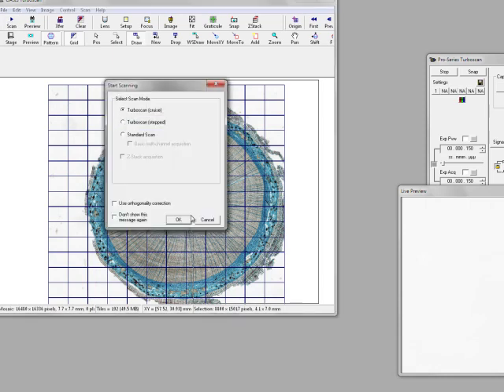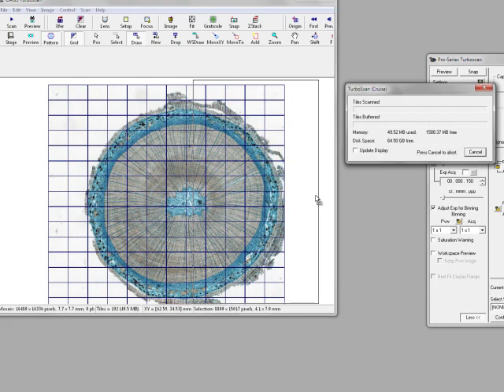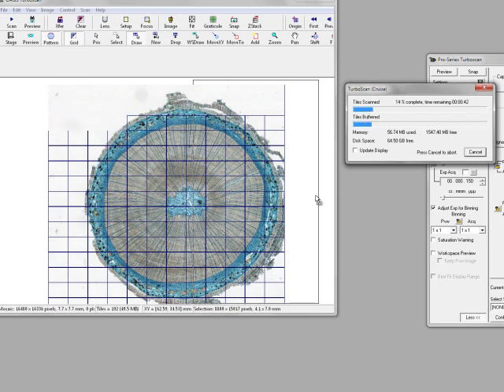So I can just say again, Turboscan that. You don't have to do this clearly. You can live with having smaller amounts, or maybe you want to be better than me and tile the whole area. So I did draw rather than select.